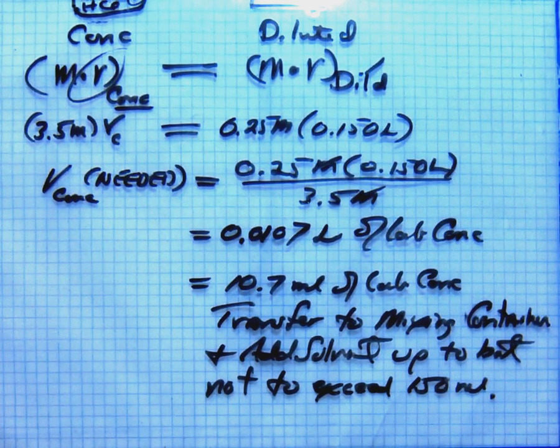Okay, so you've prepared 150 milliliters of 0.25 molar, you think, of HCl. Are you sure that you made a 0.25 molar solution? You're going to be close. That's a fact. But you now need to be able to verify that. And the way you do that is with acid-base titration. And that's the last part of this, and I can get through it.